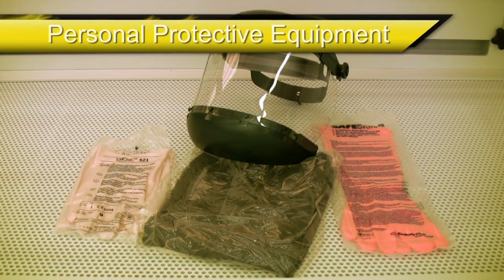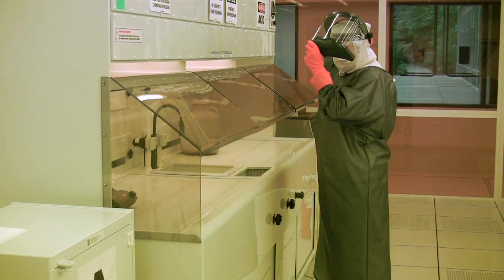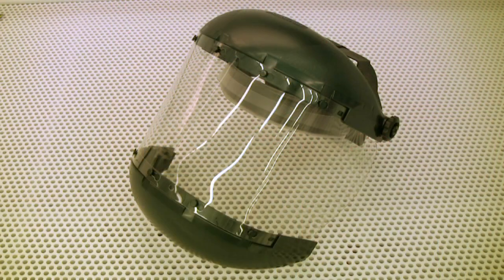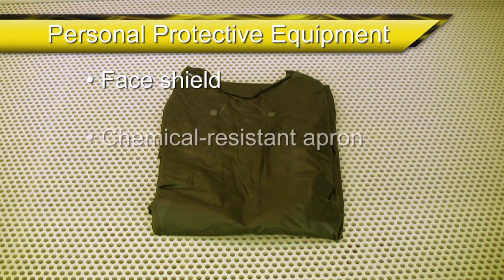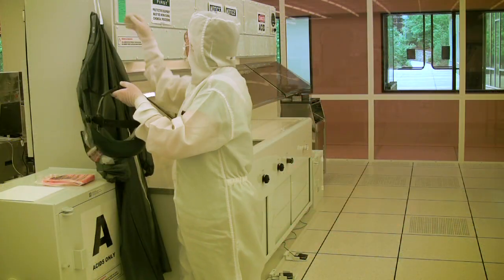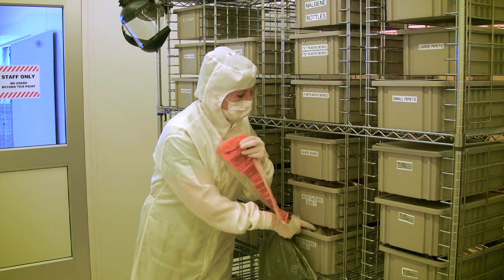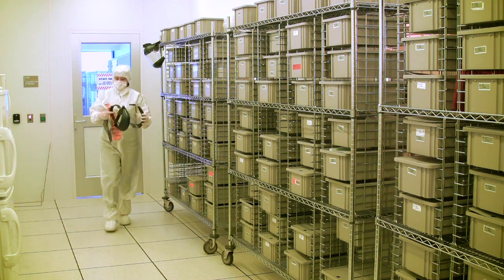Let's now discuss the required personal protective equipment, or PPE, used when handling acids or bases in the cleanroom. Whenever you use acids or bases in the fume hood, you must always wear the required PPE in the appropriate manner. The required PPE consists of a face shield, a long sleeve chemical resistant apron, and acid gloves. There should be a face shield and an apron at each fume hood in the cleanroom. The acid gloves can be found in the cleanroom supply storage area, and spare face shields and aprons can be found there as well.